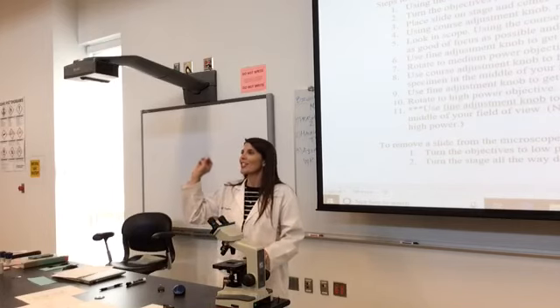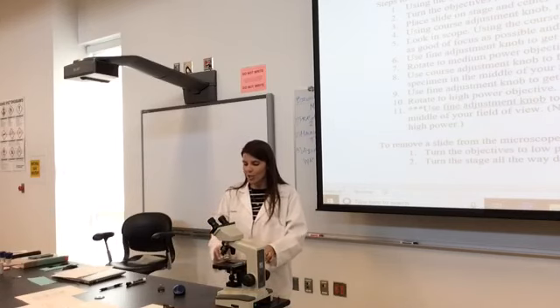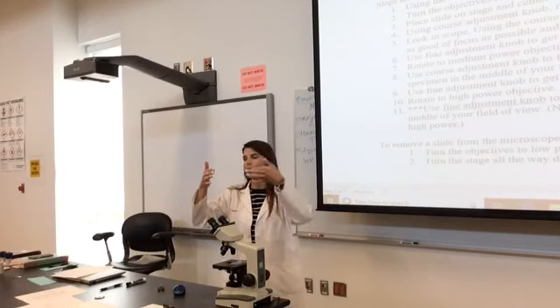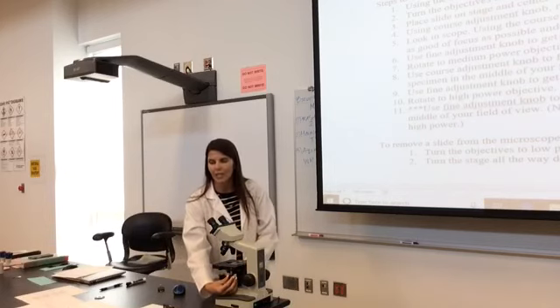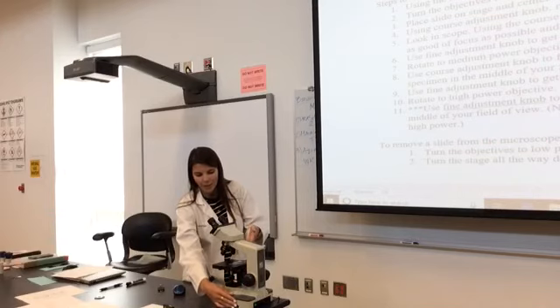You will take your slide, and you will open your mechanical stage. You will place your slide in that top right corner. Just set it there, release the claw, and it will hug your slide. I still have not looked through my oculars yet. I'm going to use these stage adjustment knobs on the right side to move my specimen over my condenser.